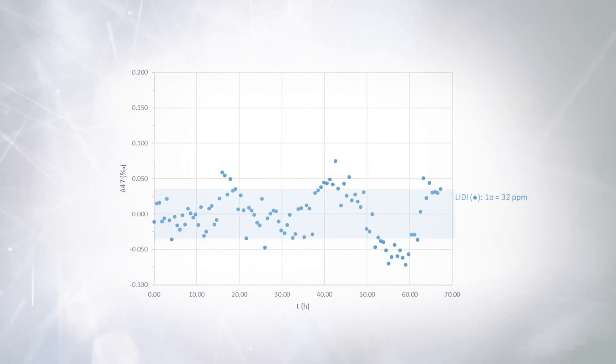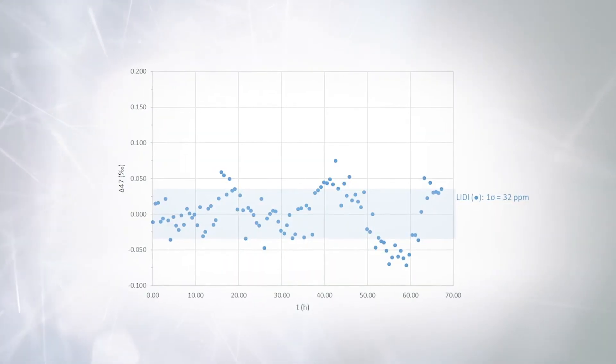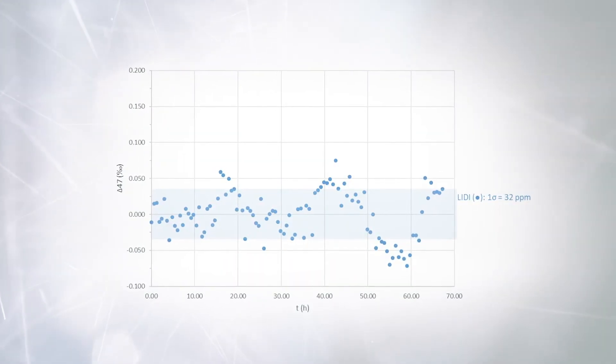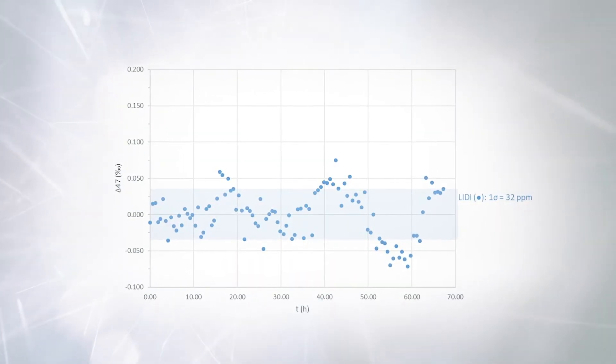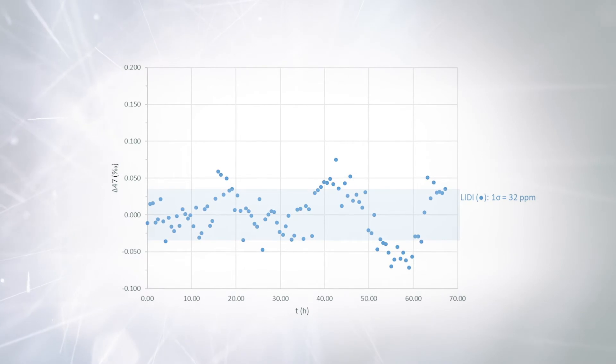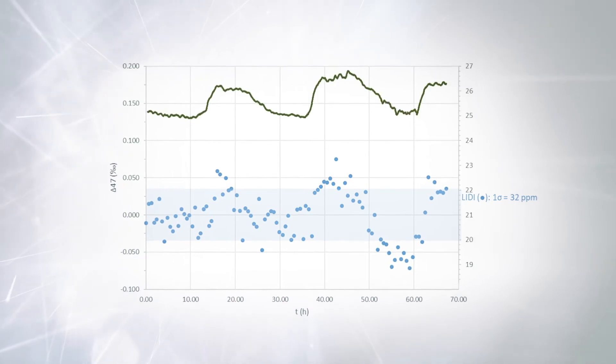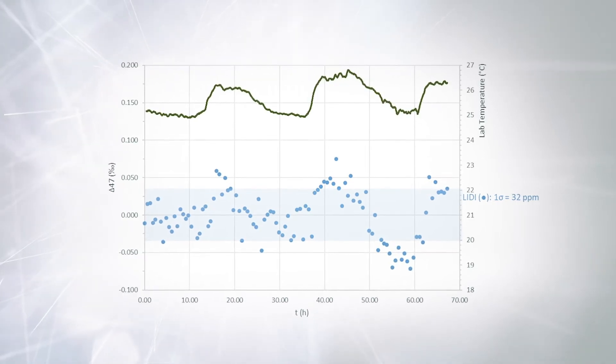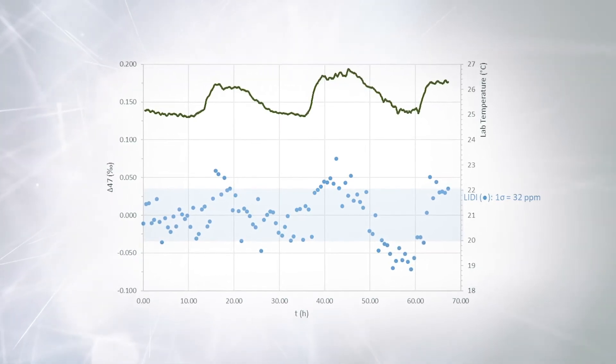Systematic drift caused by lab temperature instability can be fully removed from the data. In this figure, a drift is visible in the original data depicted in blue, correlating with laboratory air temperature represented by a green line.